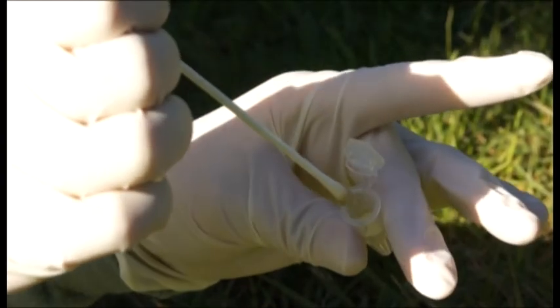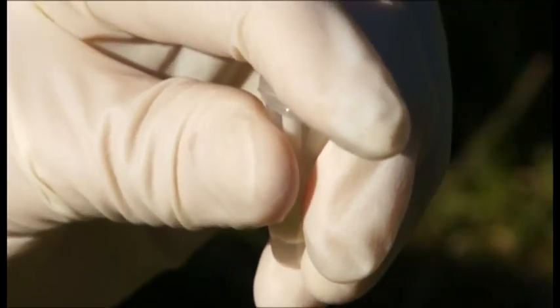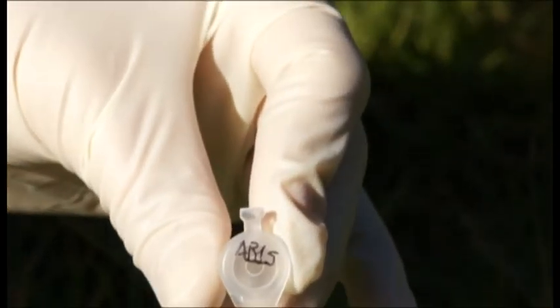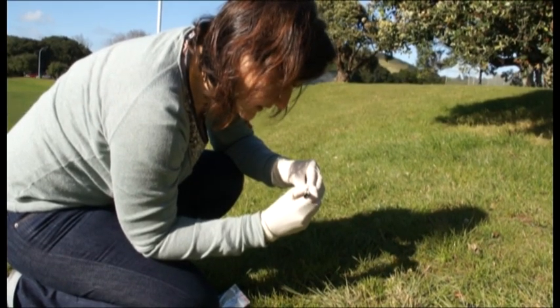Insert the swab head into the same preservation buffer tube used before and split the handle so that only the head is submerged in the buffer. Label the lid of the 1.5ml tube with a unique number from the list provided using a permanent marker, and record the unique number on the pellet data sheet.